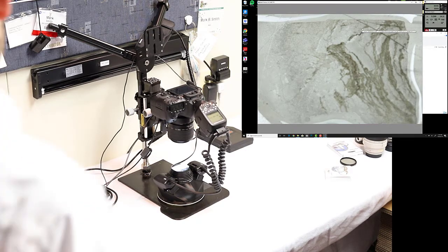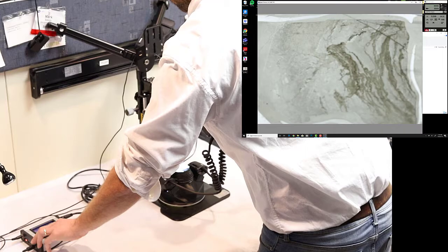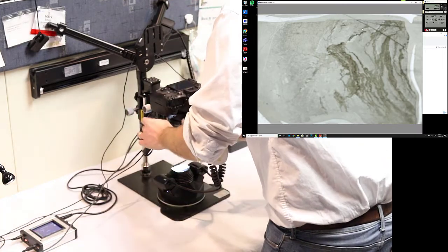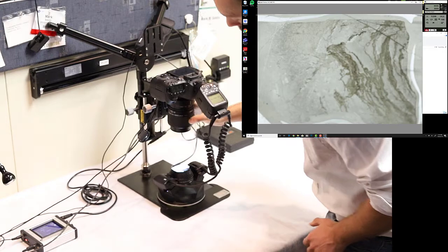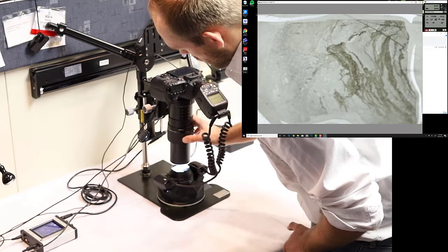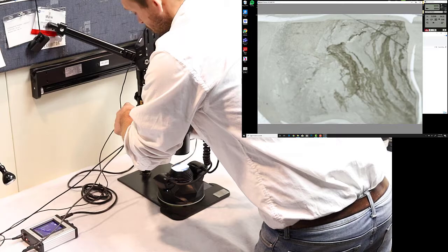Okay, now it's time to increase our magnification. So we're going to bring the camera up a little bit. We can do that a couple of ways. One is we can bring our stack shot up. The other is we can brace our camera. We can take the adapter and raise it this way, right in the adapter. But that should be plenty. What we'll do is take it right down to 5x. And now we've increased our magnification. You can also take the entire stack shot and raise this as well.